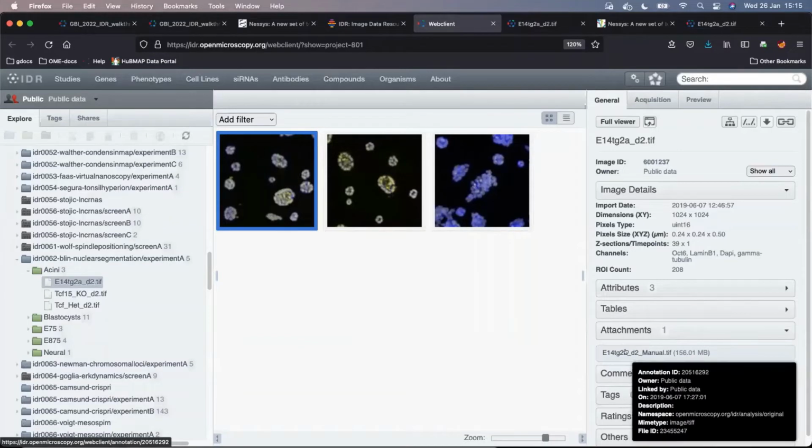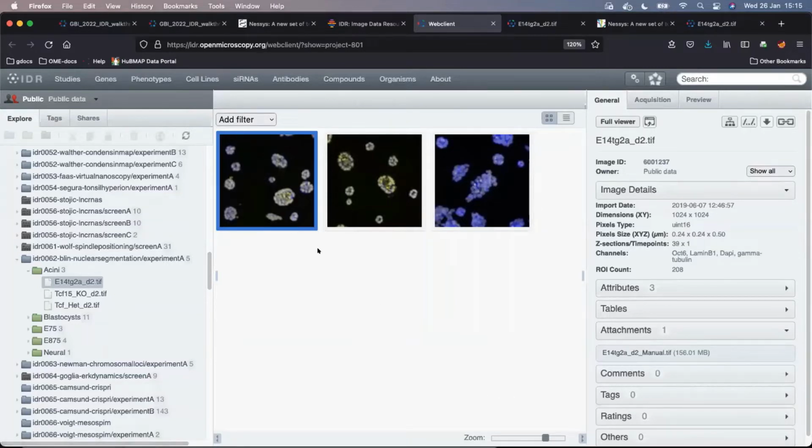It's an object in the database called annotation. Okay, file annotation. And Omero doesn't know that it's an image. In other words, okay. So that's the landscape there. Okay, I think that you understand now. Hopefully the others understood as well. It's just a curation decision for highlighting what is important and preserving what is less important, but you know, to be clean. Very good. Let's continue with the second search.